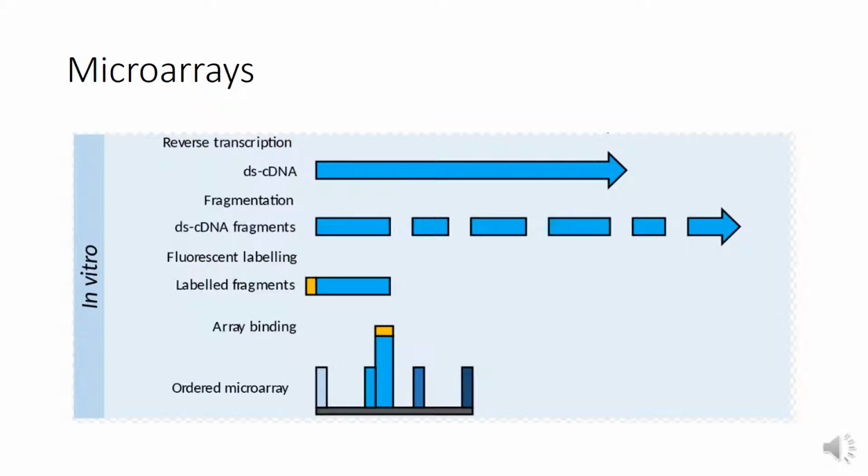First, before moving on to the rest of the paper, it's important to know what a microarray is, as it is the focus of this paper. They are a method of analyzing an unknown DNA sample. This is typically done by taking a target DNA and reverse engineering a complementary strand to that DNA. And through this complementary strand, you can determine through hybridization if the unknown DNA is the target strand.